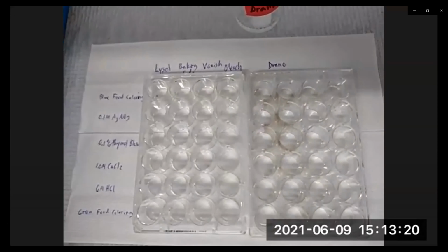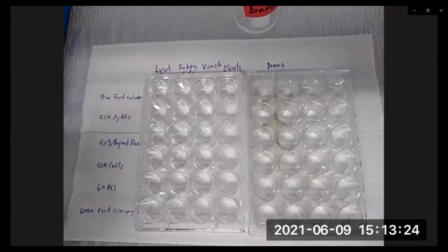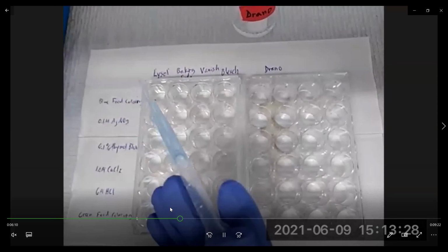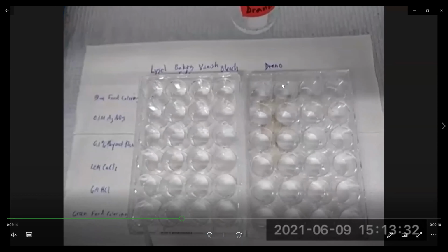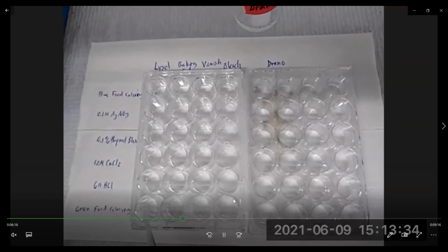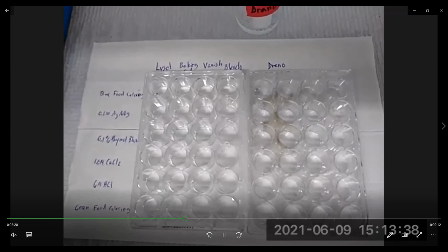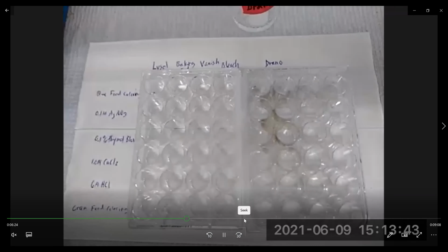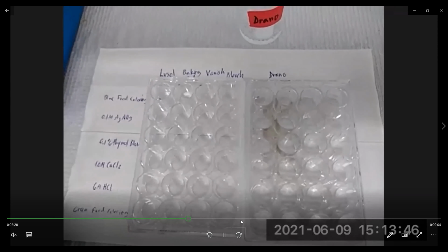So make sure you take the lid off the cell well plate. That's always important. So what we're going to show you today is the different household chemicals with green food coloring and the different reagents with Drano. So right now she's putting about 10 drops of each household chemical into the cell well plate to see if there's any reaction that occurs.